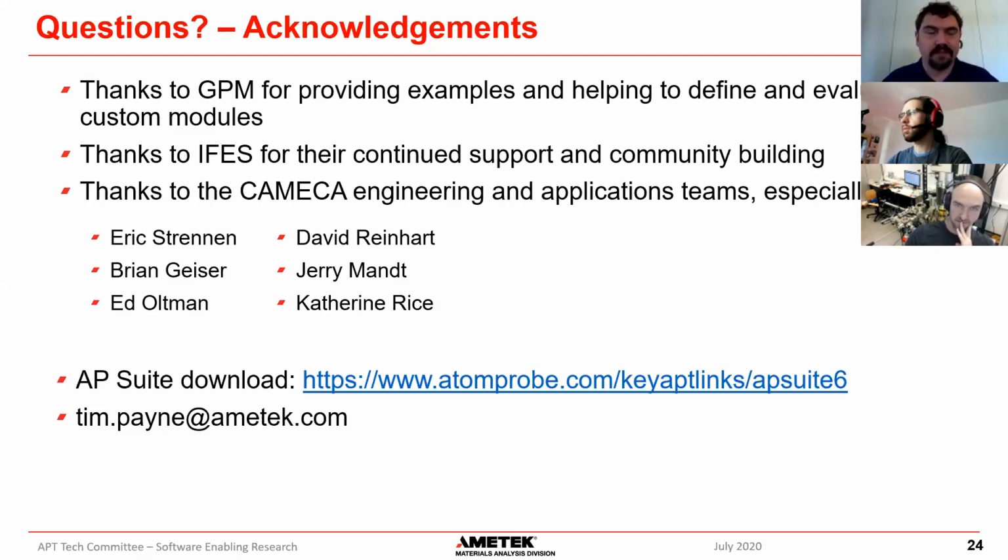So for data reporting, you might see this format being the format you report coming out of an experiment, potentially. Right, yeah. So for FAIR, for instance, I would assume that you'd want to have that entire data package available online.